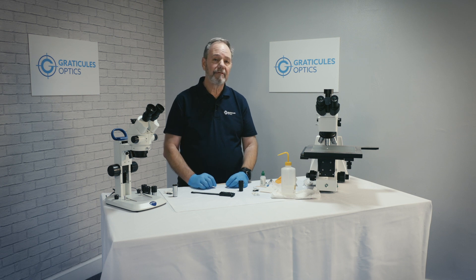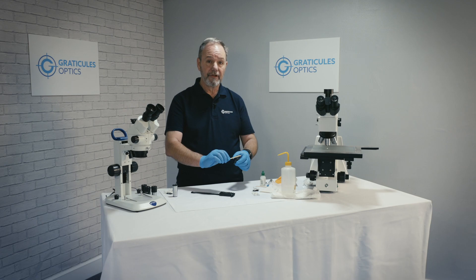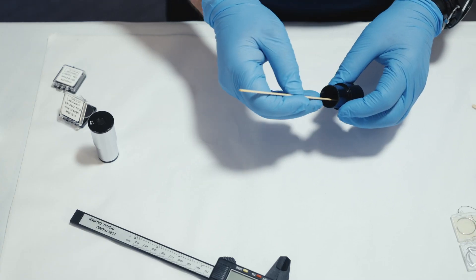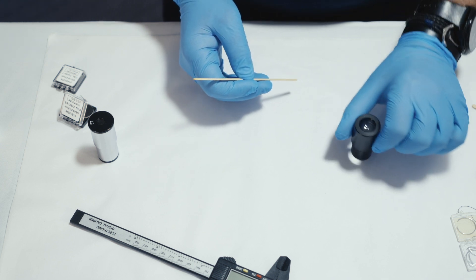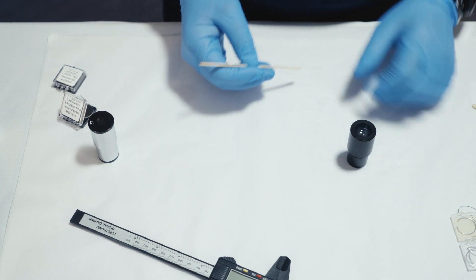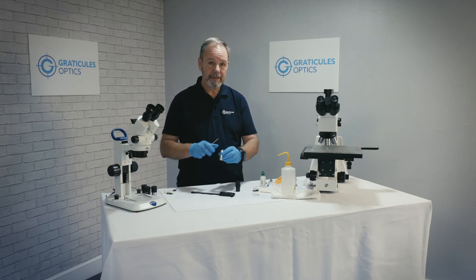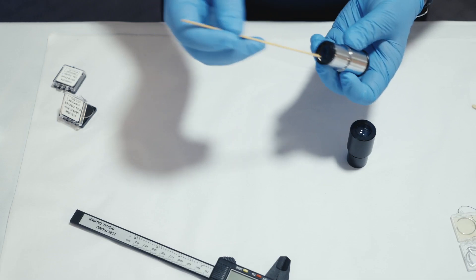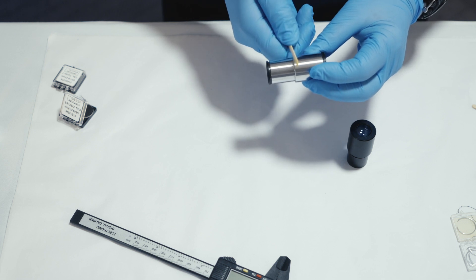The Ramsden or Kelner type has lenses above the reticule mounting position, which means we have an open tube from the bottom. There may be some disassembly required, but generally it's far simpler to fit a reticule to this type of eyepiece. The second design is called the Huygenian type. It contains a lens element on the top and on the bottom, which means we need to open the eyepiece to mount the reticule inside the tube.